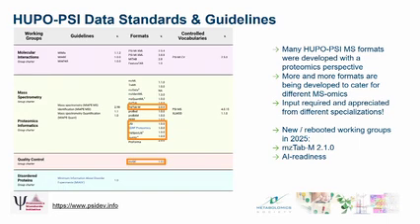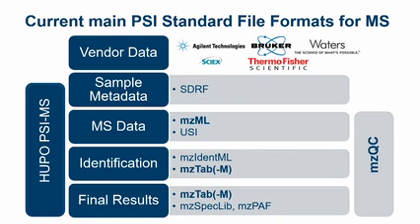On top, we have mzSpecLib for spectral library information, and mzPAF, which is currently really geared towards proteomics, but might also be extended towards metabolomics in the future to annotate individual peaks in mass spectra. And last but not least, mzQC. So there are also new working groups booting up at the moment, for example, on AI, and we are just now reinvigorating the mzTab for metabolomics working group.